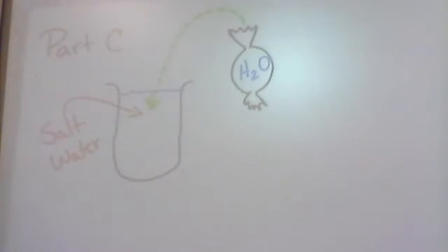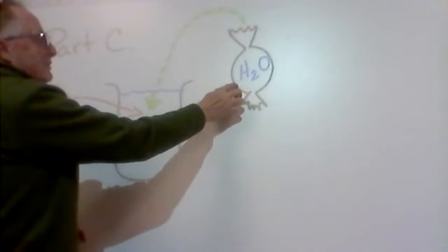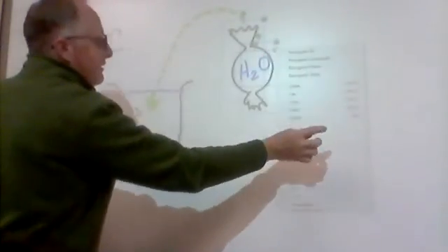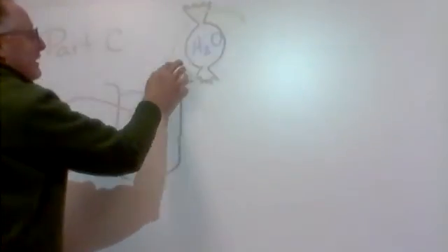Okay, part C. Let's hope that this one got tied tightly this time. They put pure water inside the cell. Whoops. Whoa. Wow, we have a cell coming all apart here. That's better.